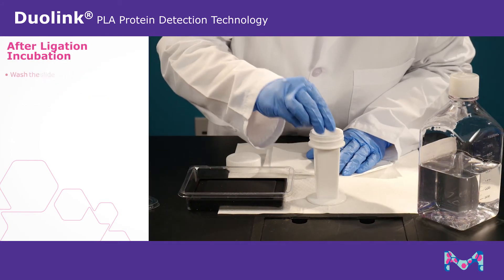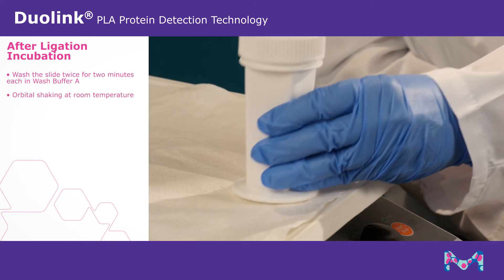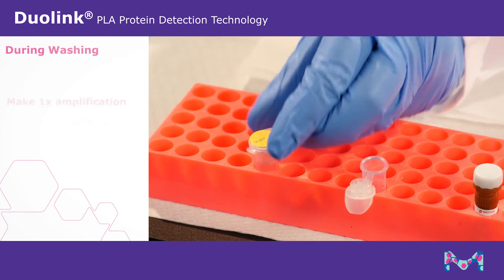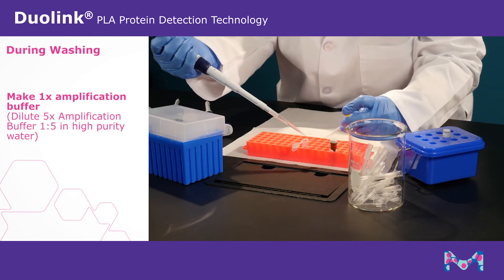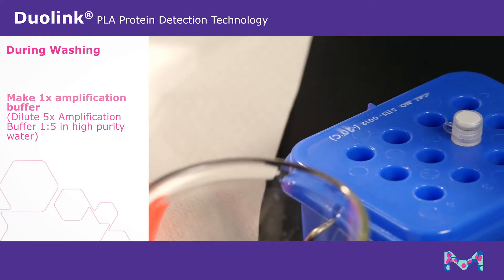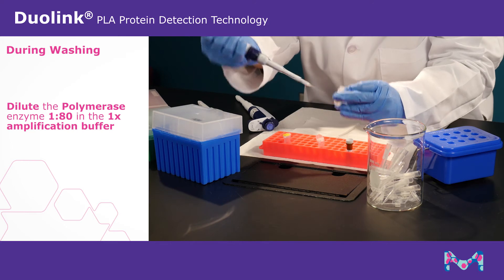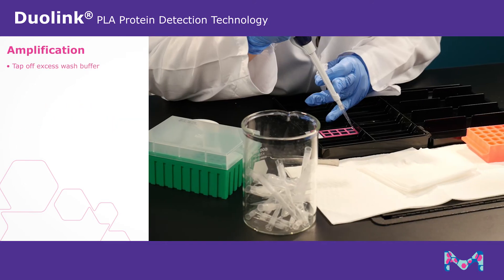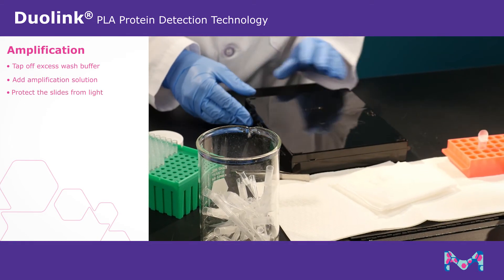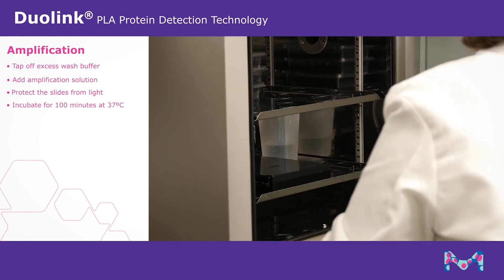After ligation incubation, wash twice in wash buffer A for two minutes each with gentle orbital shaking at room temperature. During washing, make 1X amplification buffer by diluting the 5X amplification buffer 1 to 5 in high purity water. Dilute the polymerase enzyme 1 to 80 in the 1X amplification buffer. Tap off excess wash buffer, add the amplification solution to each well, and protect the slides from light from this point forward. Incubate for 100 minutes at 37 degrees Celsius.